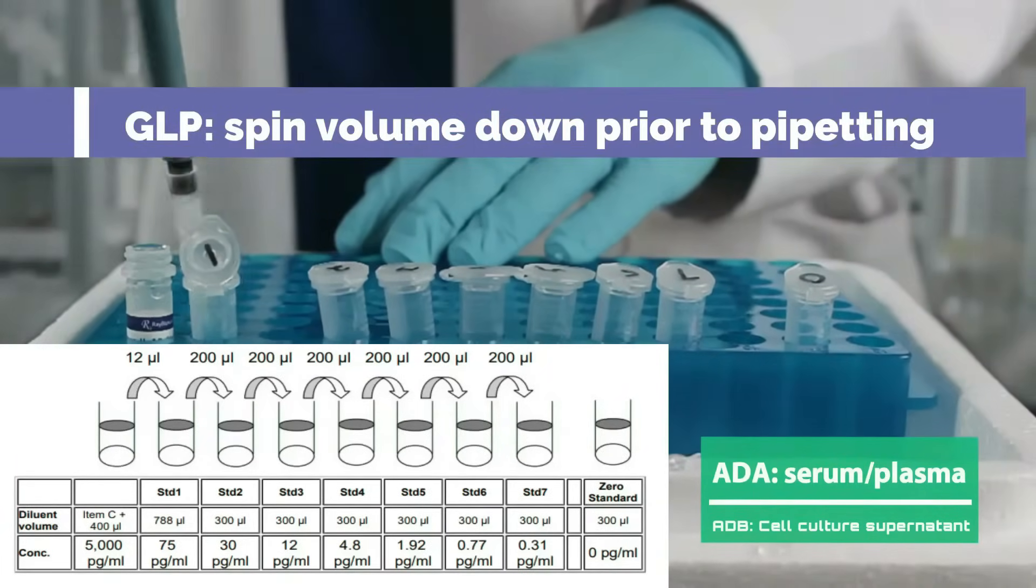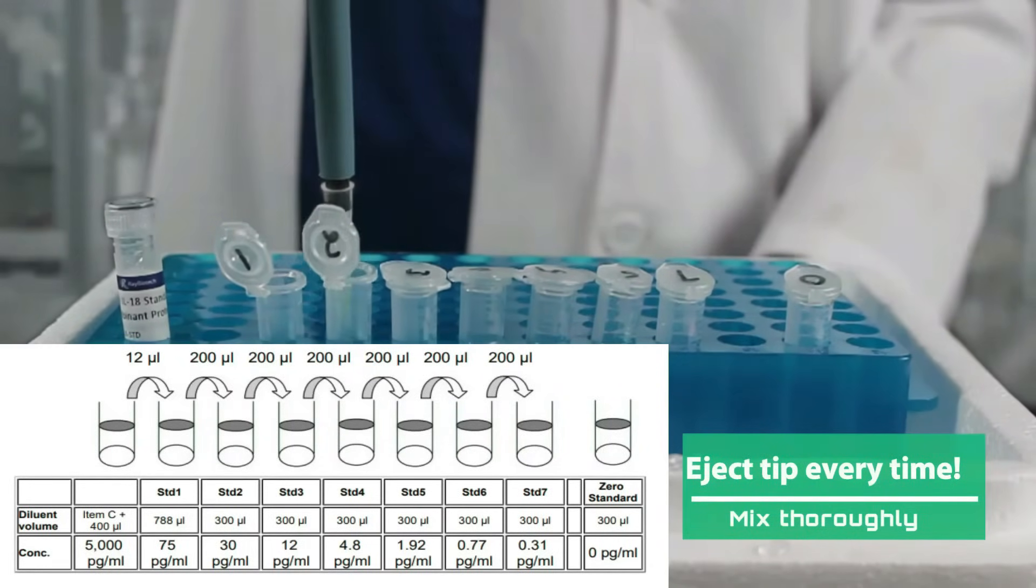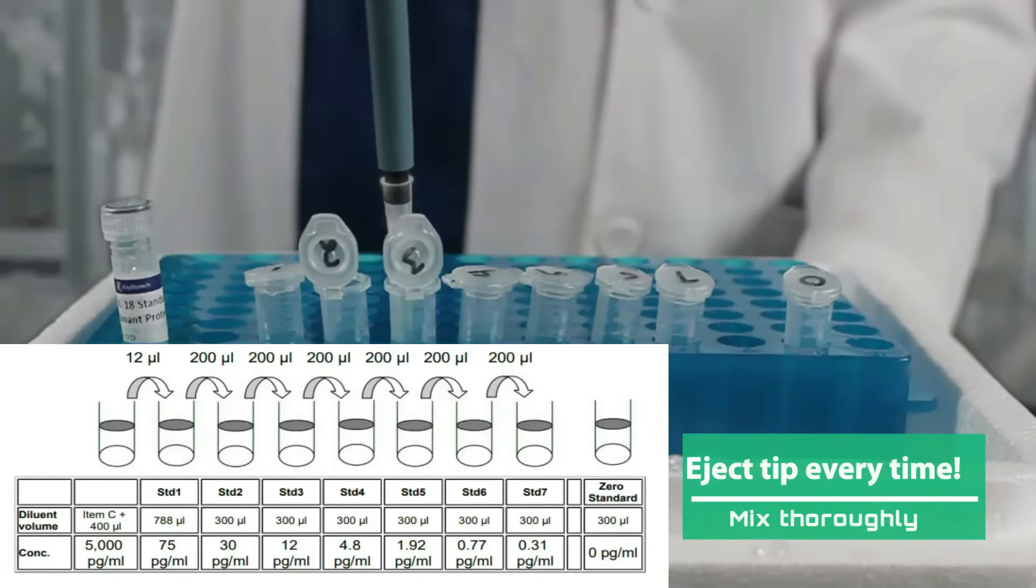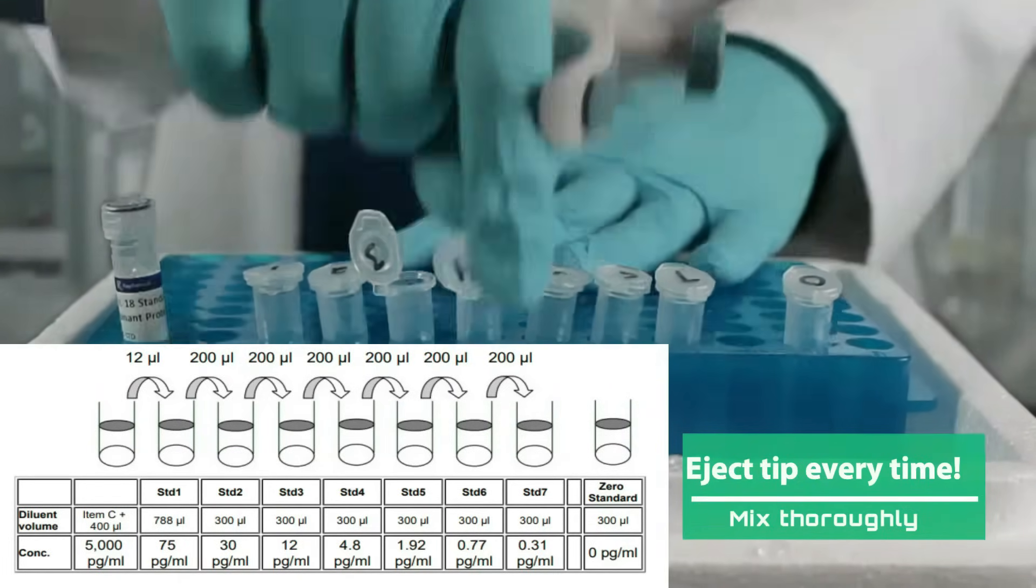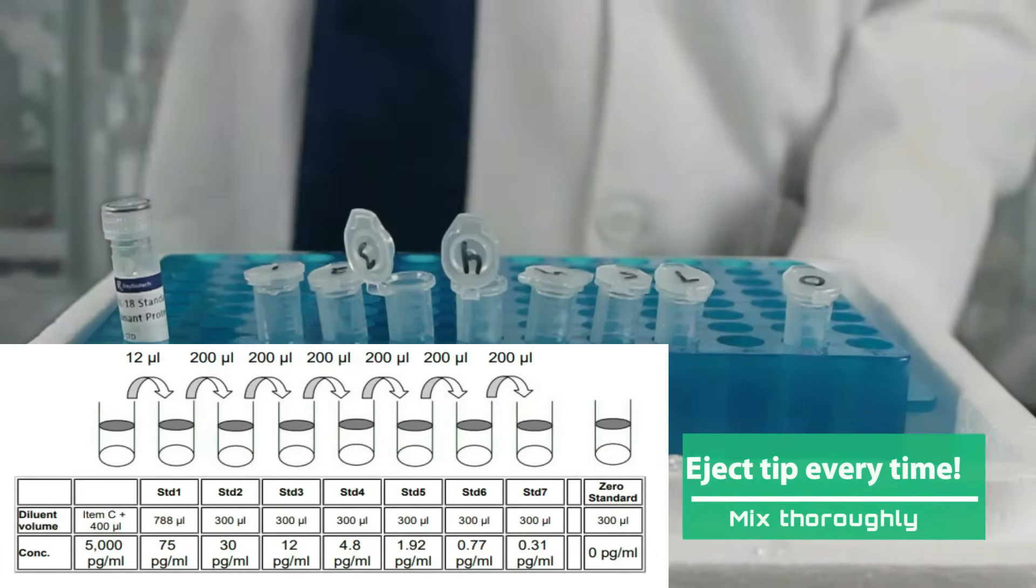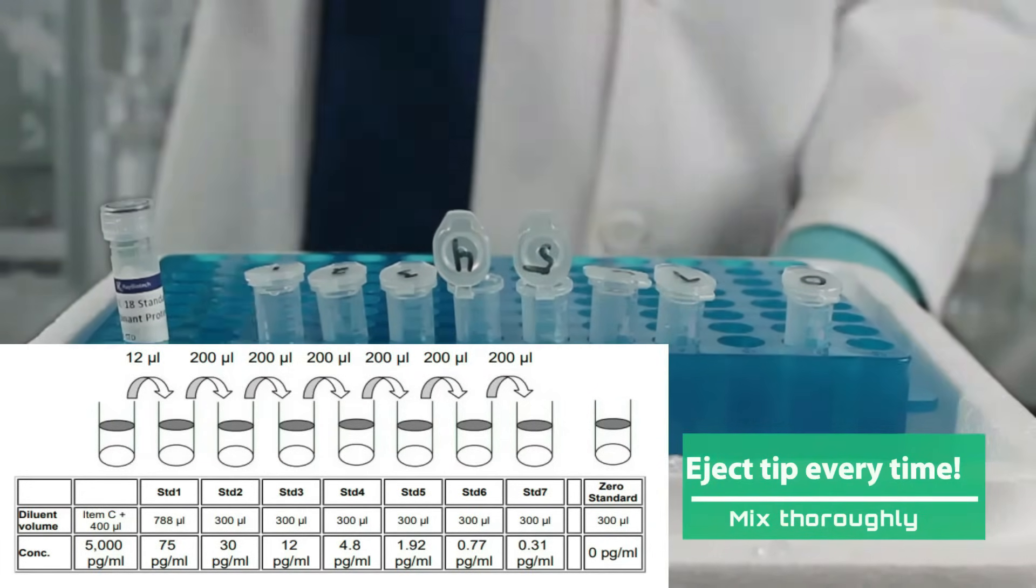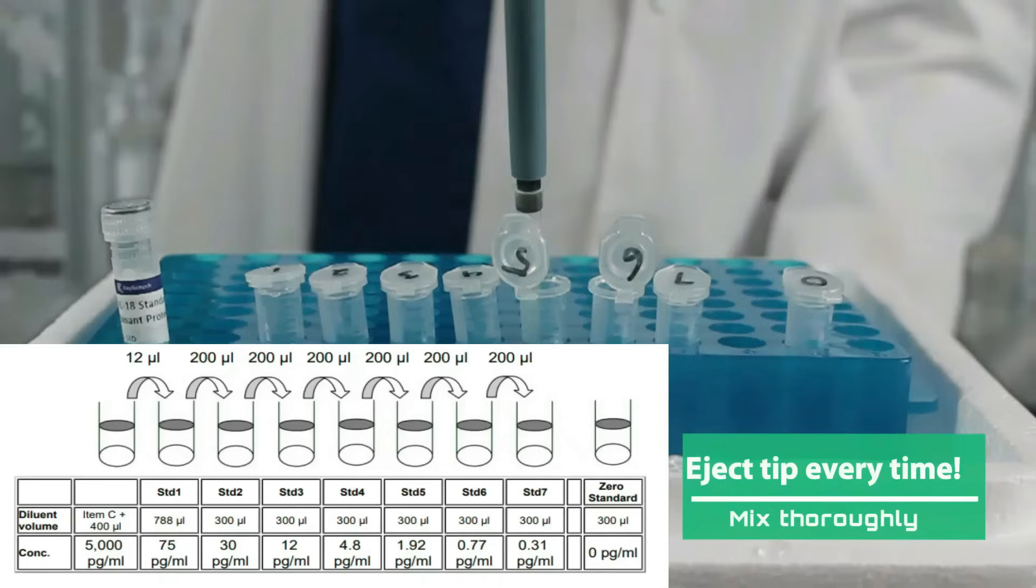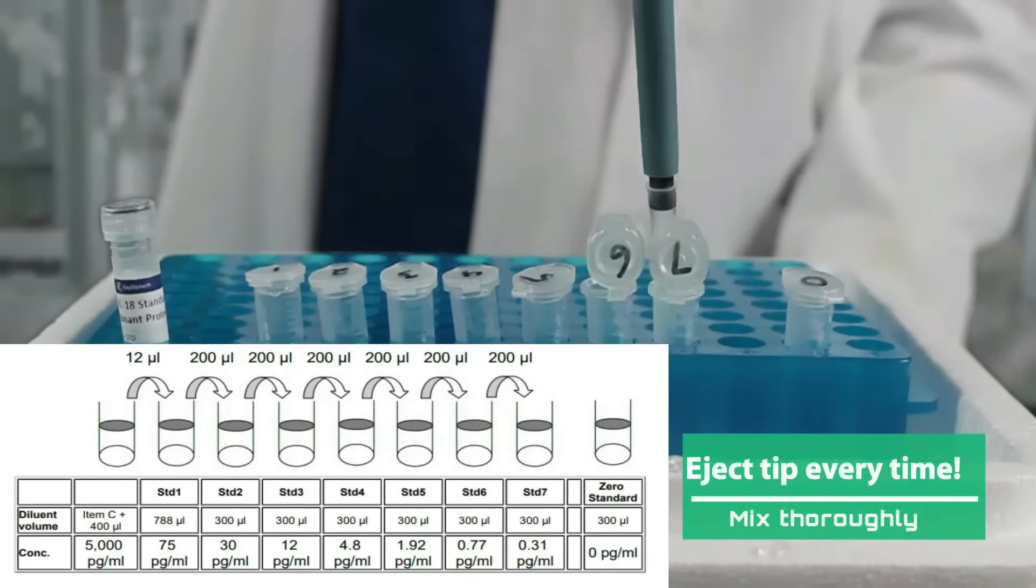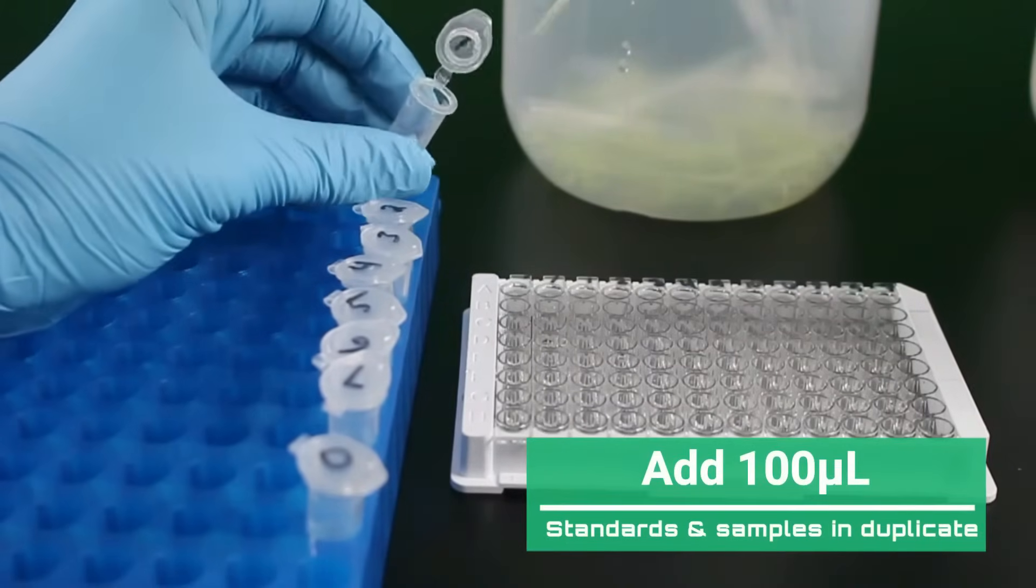Pipette 12 microliters of stock solution into standard 1. Mix thoroughly and gently with repeated pipetting at least 10 times. Eject the tip, carry 200 microliters from standard 1 to standard 2, mixing thoroughly and gently again with repeated pipetting at least 10 times. Eject the tip and repeat the step until standard 7. Eject the tip each time so the high concentration of tube 1 does not influence the concentration of tube 7 incidentally. Keep the zero separate to prevent accidental passage from the standard.